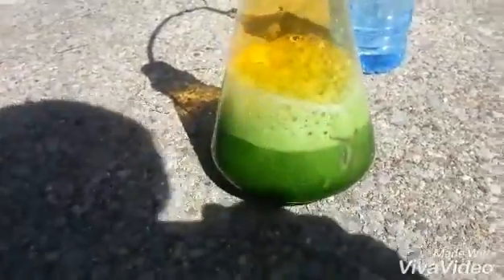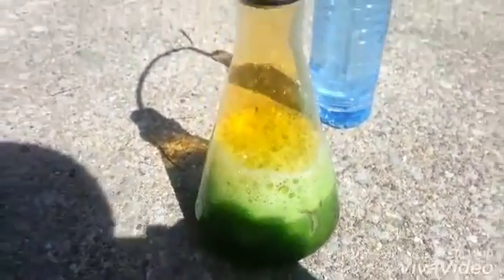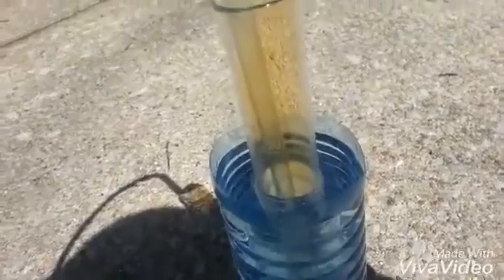As you can see, it took about half an hour, but the reaction has started. That brown gas is nitrogen dioxide, which is then carried over by the tube through the pipette into the graduated cylinder.